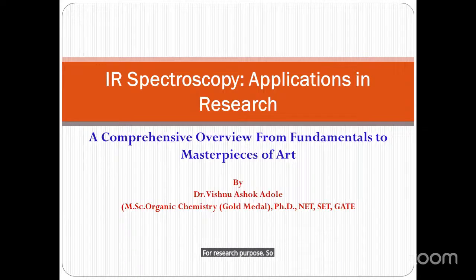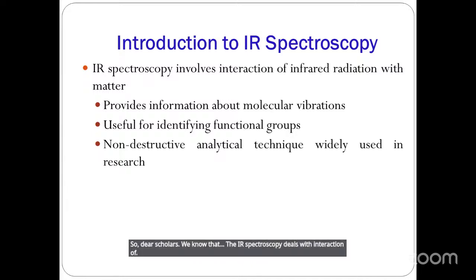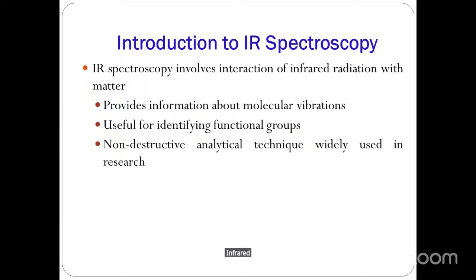So the topic of my today's talk is IR spectroscopy applications in research, a comprehensive overview from fundamentals to masterpieces of art. So dear scholars, we know that IR spectroscopy deals with the interaction of infrared radiation with matter.